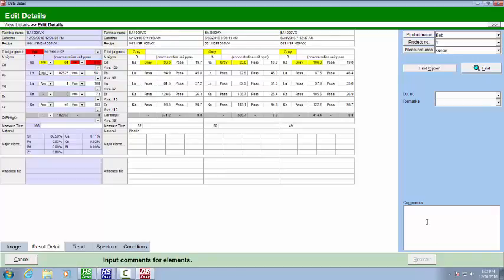Then I come down here and comments. I have to put in a reason why I've passed it. And a supervisor must do this to get it through. So they can be edited and given real explanations as to why you're going to pass it, even though you've modified it. Otherwise it cannot be modified.